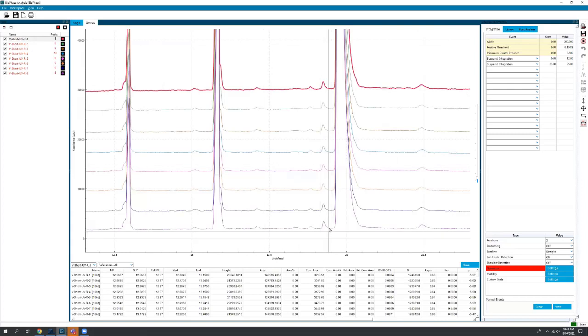But what is really important to know is that if you look at our 8 capillaries, really everything looks almost identical as far as the profile goes. So in all 8 capillaries, we have this light chain back shoulder. We have great resolution. Here we can see our thioether linked half antibody, and our 10 kilodalton markers up here.